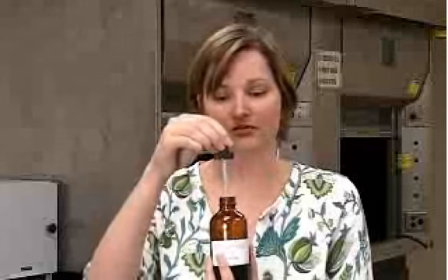Okay, third on the list is using chemicals, which obviously you will do in chemistry lab. When you go to use a chemical, you'll notice that the reagents will have either their own dropper if it's a liquid or their own spatula if it's a solid. And what you need to always keep in mind is never cross-contaminate. You never want to take the dropper from this bottle and put it into another bottle.